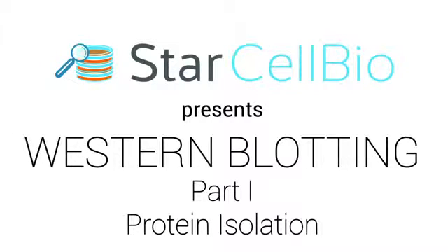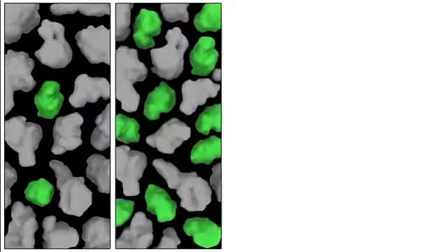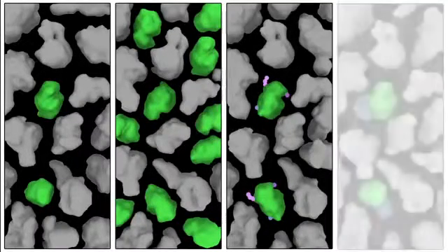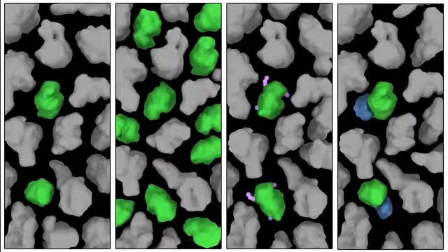Western Blotting Part 1, Protein Isolation. In this animation, we will introduce you to an experimental technique called Western blotting. Western blotting is a technique that allows researchers to detect changes in a particular protein of interest, such as changes in concentration, addition or subtraction of small chemical modifications, and changes in interactions with other proteins.